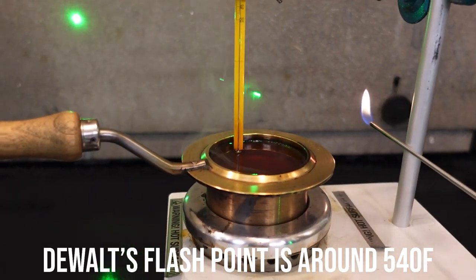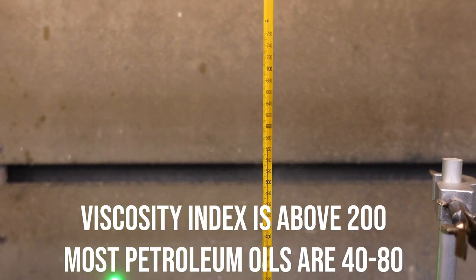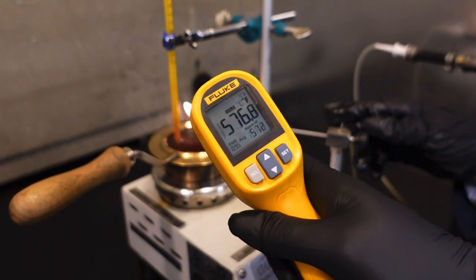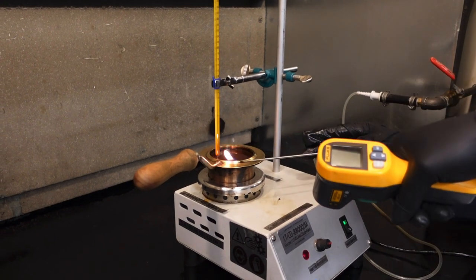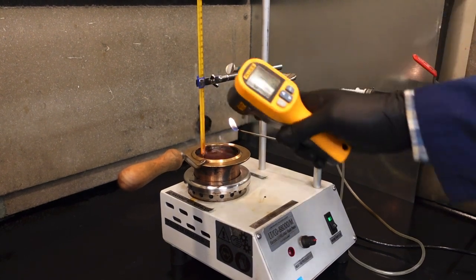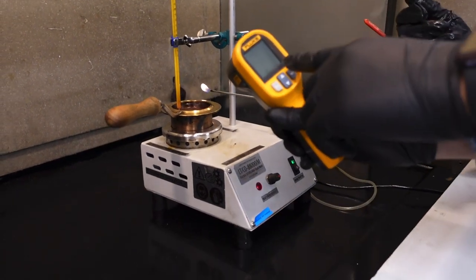You can definitely see it's smoking now. It's saying it's hotter. Well, it's reading the bottom — the hottest part — but it's not reading the average throughout the cup. The average throughout the cup is 570.